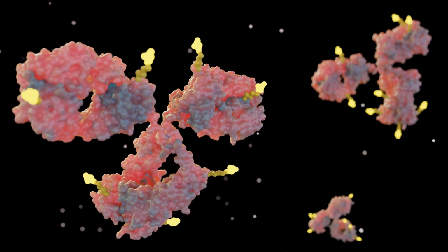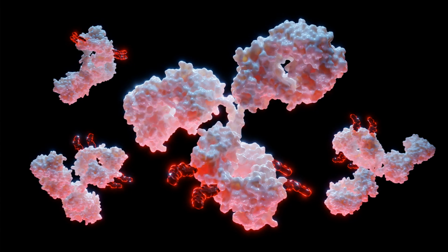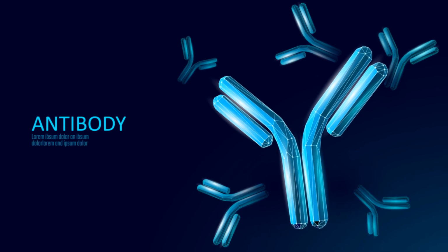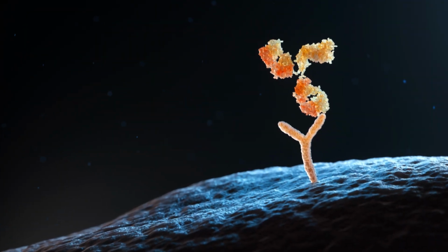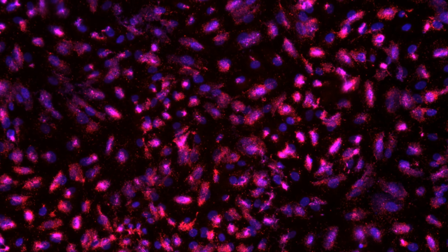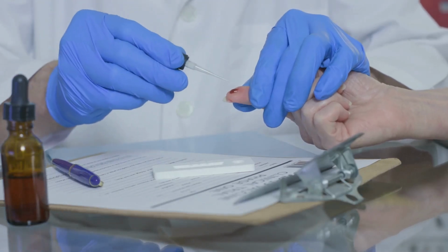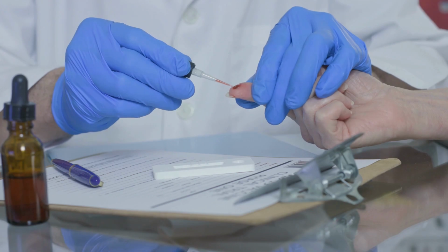Antibodies as molecular beacons: structure and labeling. To understand how FIA works, it's helpful to visualize the structure of an antibody. Imagine a Y-shaped molecule with two arms and a stem. The tips of the arms are the antigen binding sites, each tailored to latch onto a specific antigen. The stem, known as the FC region, is where the fluorescent dye is typically attached. This labeling process is carefully designed to avoid interfering with the antibody's ability to bind to its target.